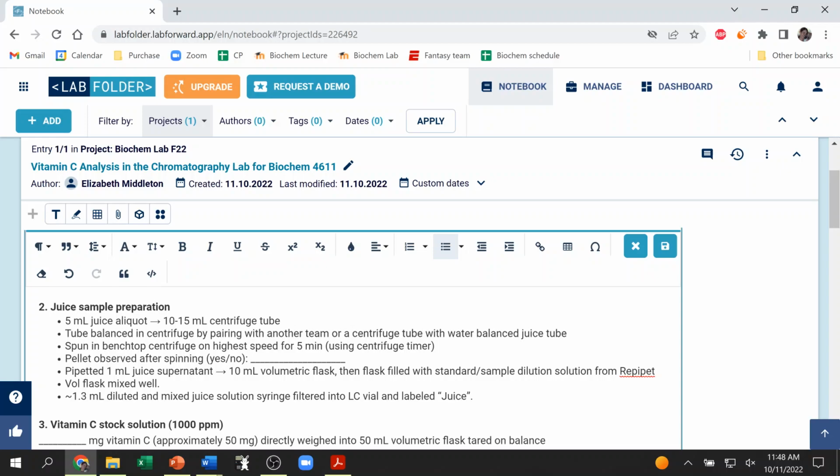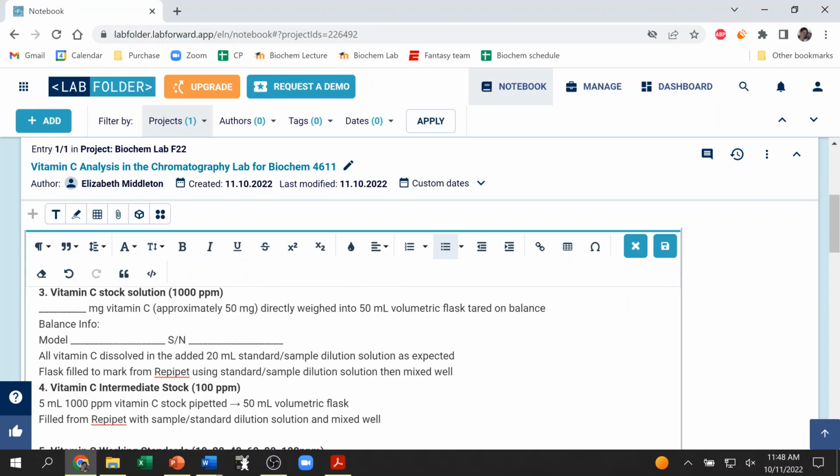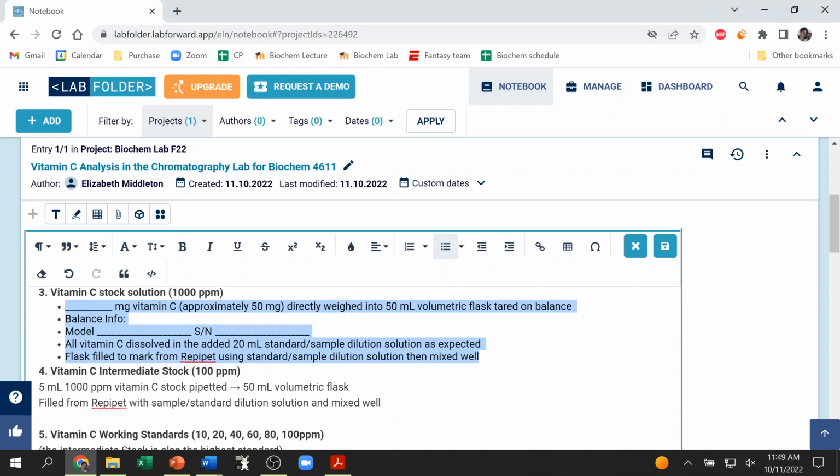It's always good to also check if any special characters carried over. For example, depending on the arrows that are in there, they may or may not carry over, so you might have to copy and paste those manually. But in this case, they did copy just fine. Okay. So, all right, section 3, we'll just put some bullet points, make it look a little nicer.